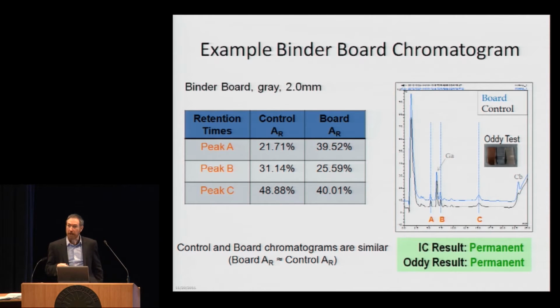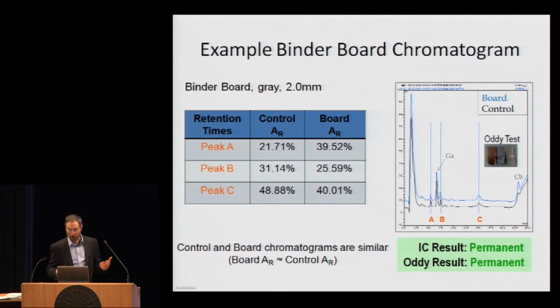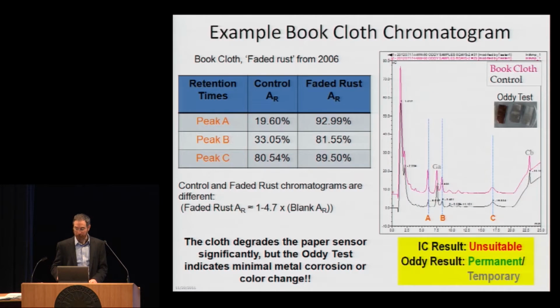So now I'm going to show you a couple of examples of what we found. We looked at those 22 or 28 materials, did an Oddy test and an IC test for both, and found a range of results, which I'll show. So here's the Oddy test for this material. It was a binder board, and it basically had an identical IC spectrum between the control and the sample itself. So we would call it permanent. We can say okay to use this with organic materials, and in fact with non-organic materials. It seemed to pass both tests well.